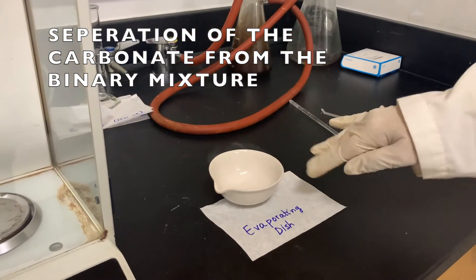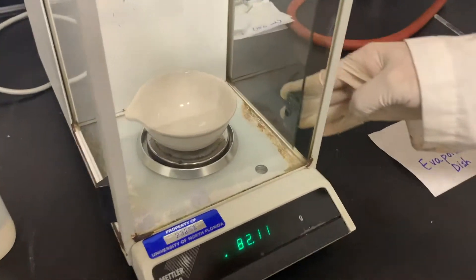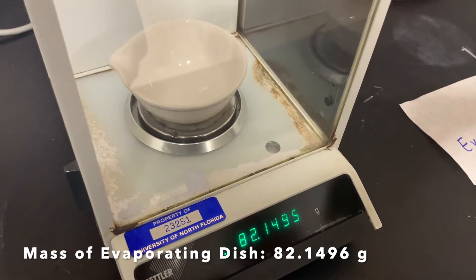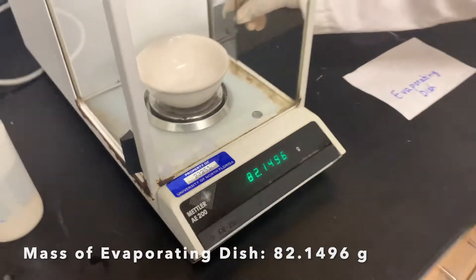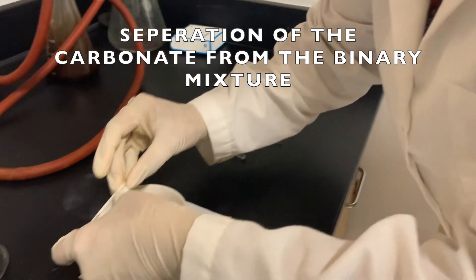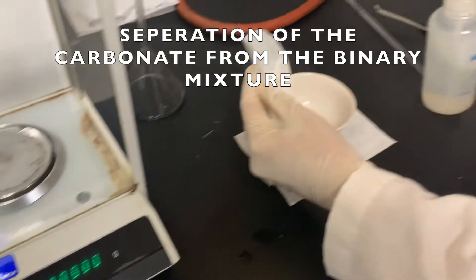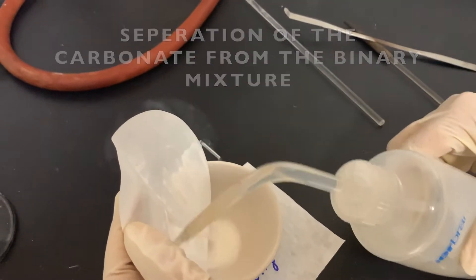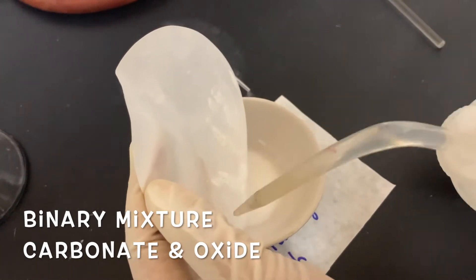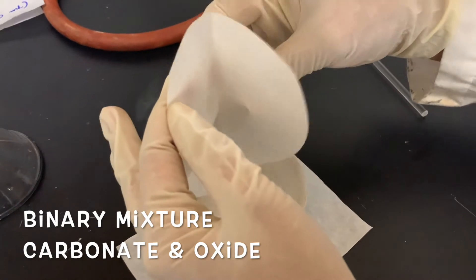We are going to take this binary mixture of carbonate and oxide into the evaporating dish. But before that, I'm going to weigh the evaporating dish because we need the empty weight. I put it on the analytical balance, and the weight of the evaporating dish is 82.1496 grams. Now I'm going to transfer this binary mixture into the evaporating dish by unfolding the filter paper, with the help of some water.